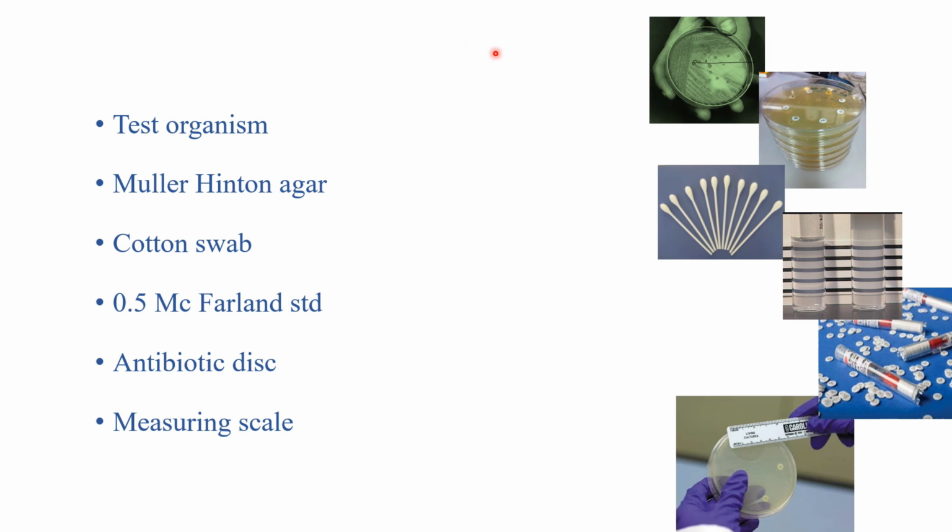For this diffusion method, we need a test organism, Mueller-Hinton agar, cotton swab, 0.5 McFarland standard, antibiotic disk, and measuring scale.